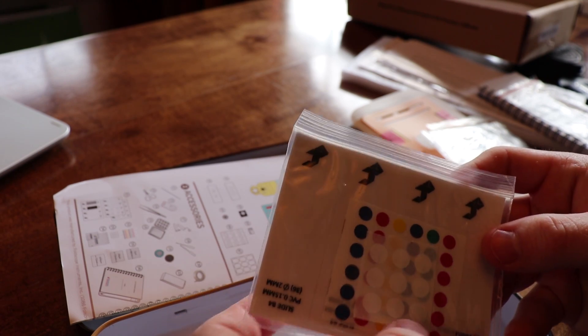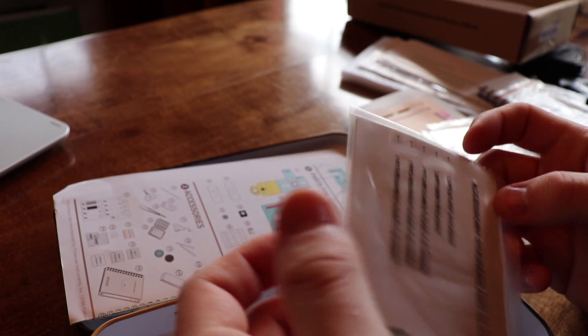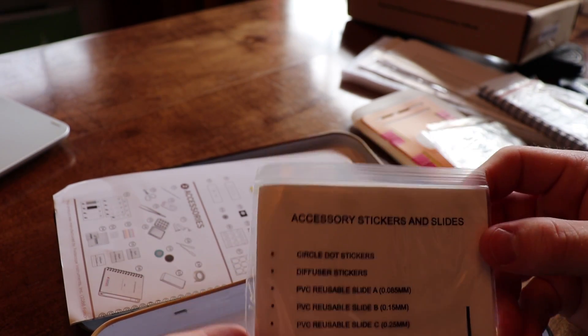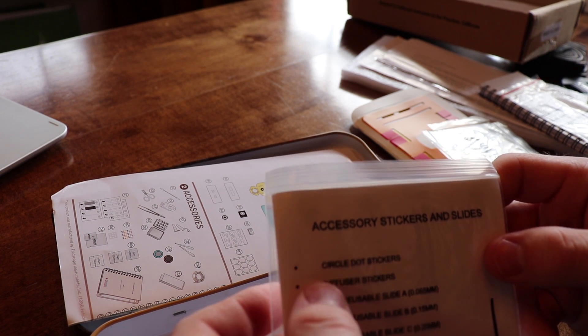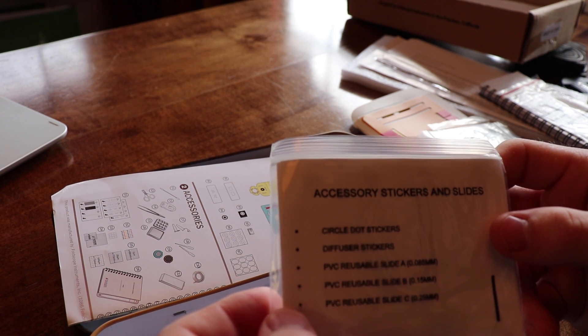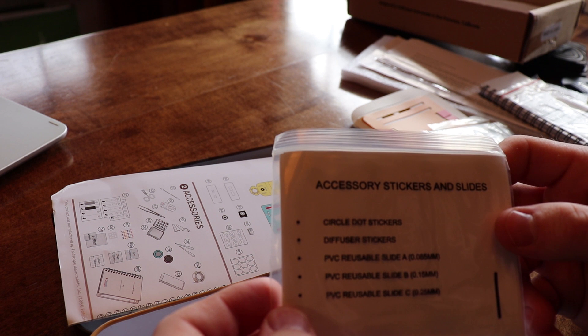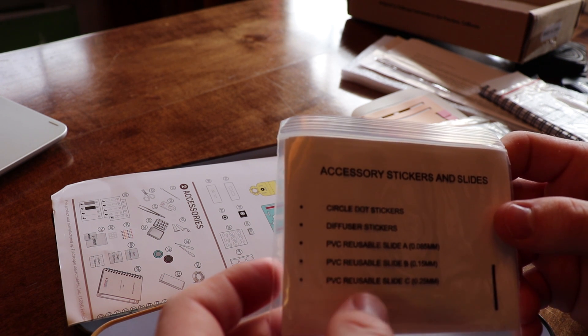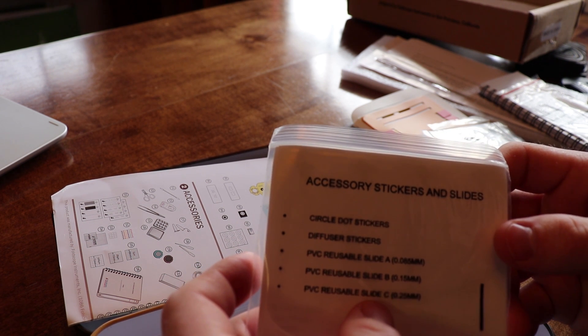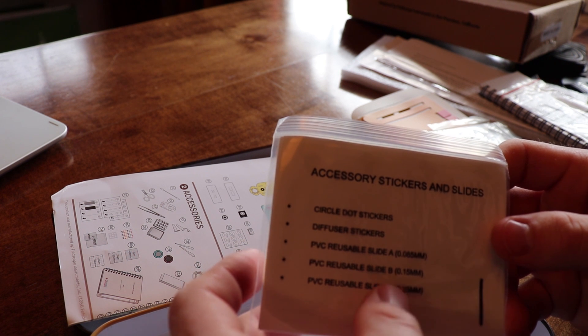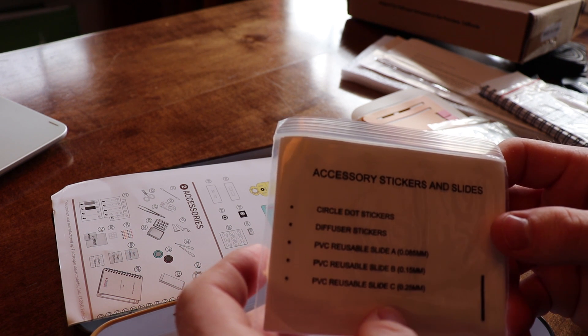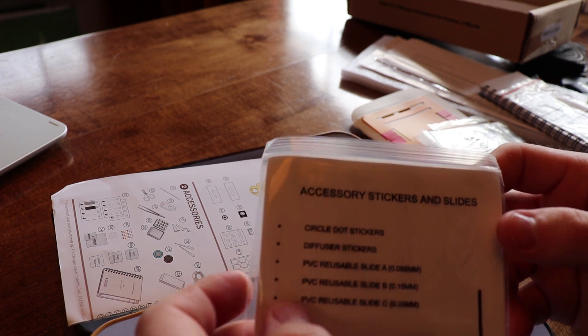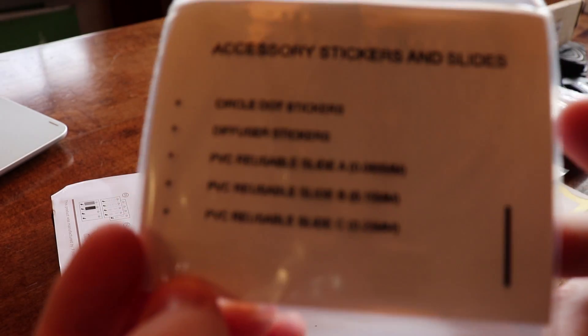Okay, so it looks like little stickers. Okay, here we go. Accessory stickers and slides. Circle dot stickers, diffuser stickers, PVC reusable slide A, B, and C at .085mm, .15mm, and .25mm respectively. Hopefully you can read that.